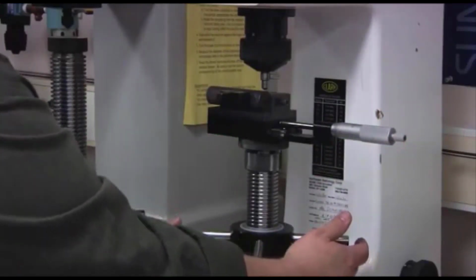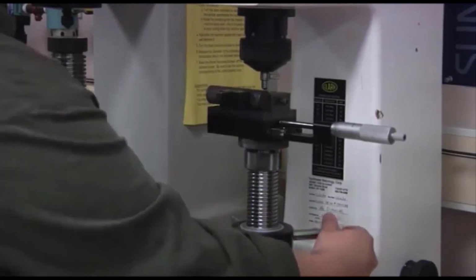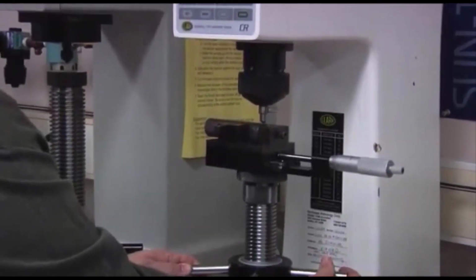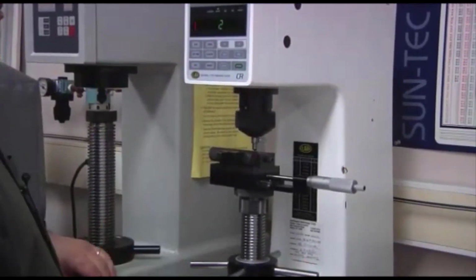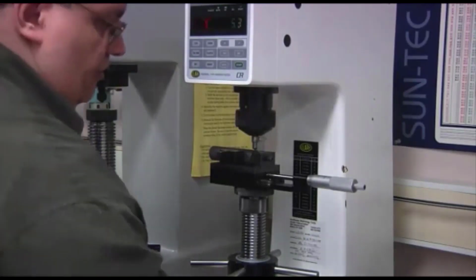Procedure for making the measurement is the same as always. Use the handles to raise the platform up until the indenter makes contact, and then slowly raise, watching the LED at the top of the panel, stopping when we reach the green set LED. So our first measurement is 55.3.